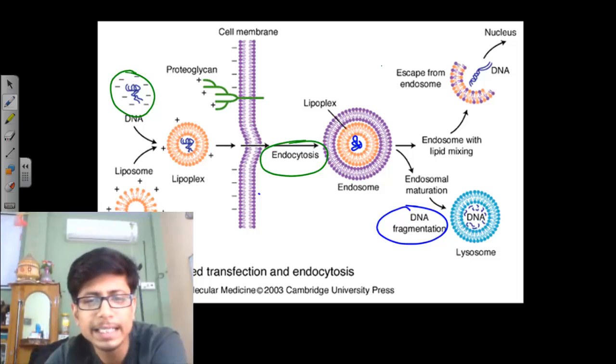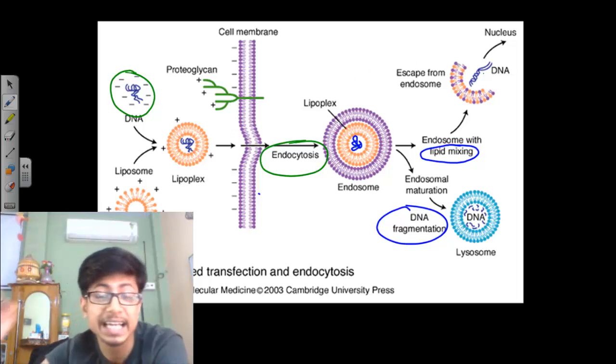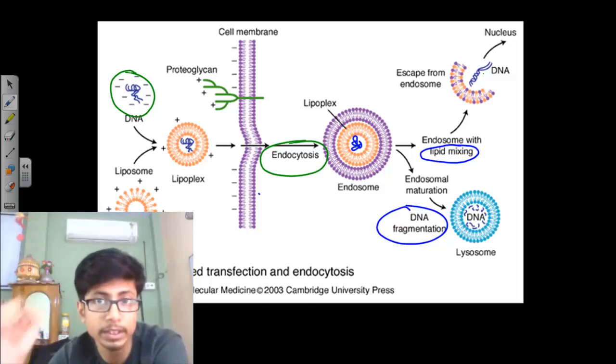So what we want here is that this lipoplex, as you can see, the lipoplex and the endosome are kind of mixed with one another. As they mix, this DNA becomes free and the DNA will be inserted inside the nucleus through the nuclear pore.